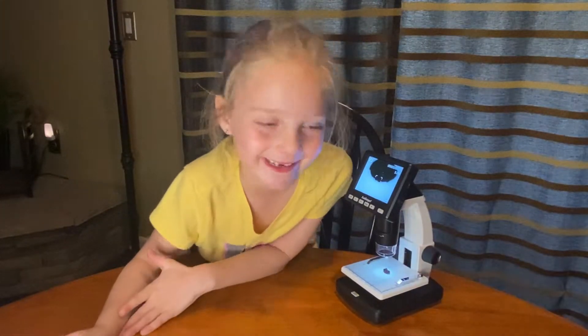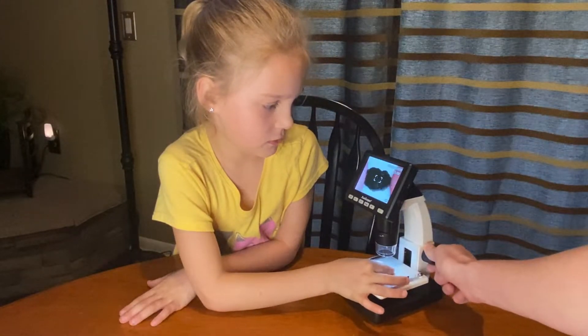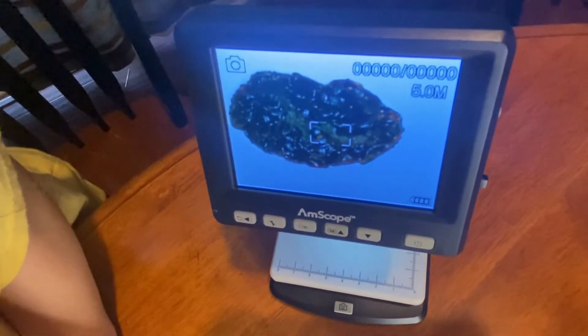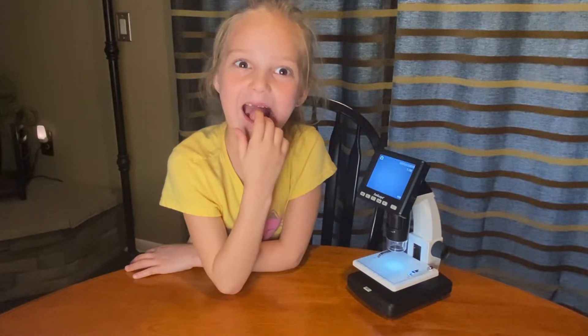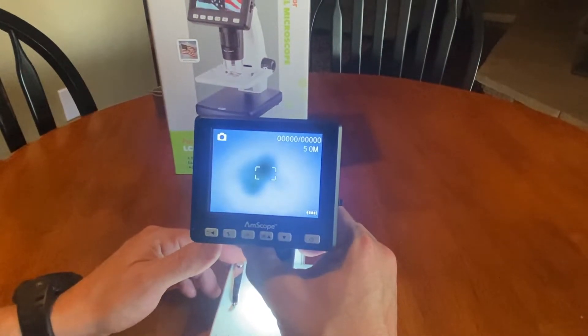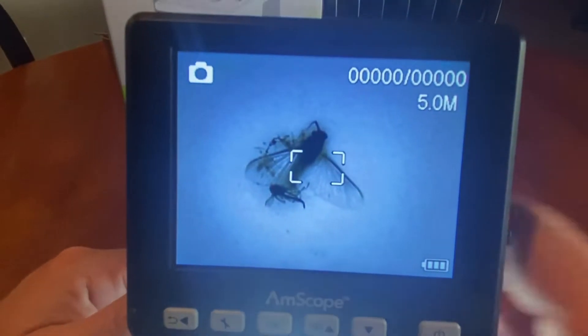Let's try a raisin. It kind of looks like a black rock, but if you feel it, it's kind of squishy. Raisin going in my mouth. Fallon and I went outside and we found a fly in a spider web — check that out. Let's see if we can get a little closer.